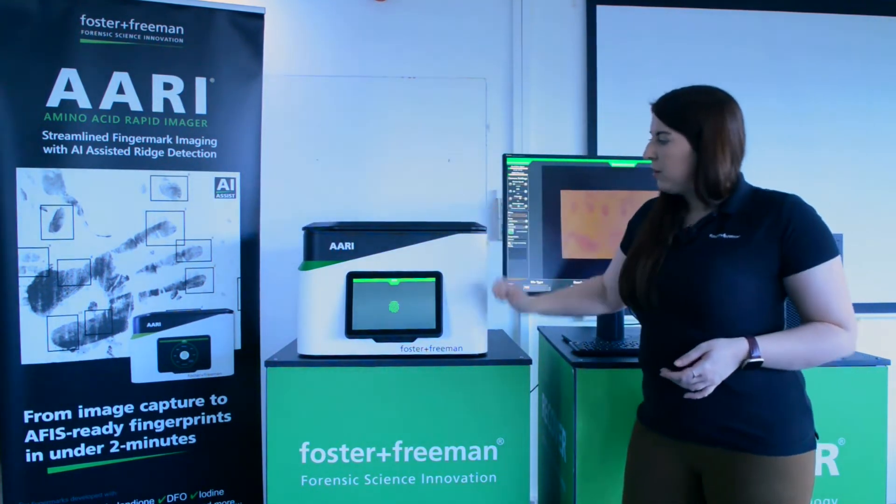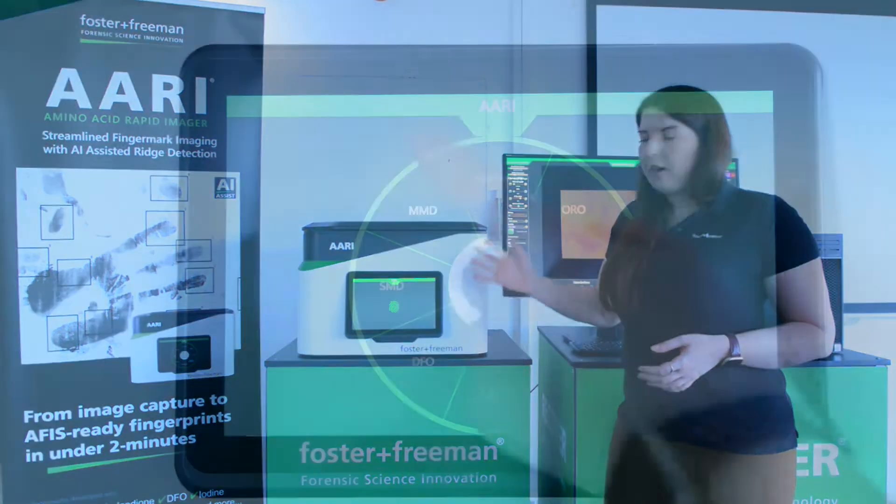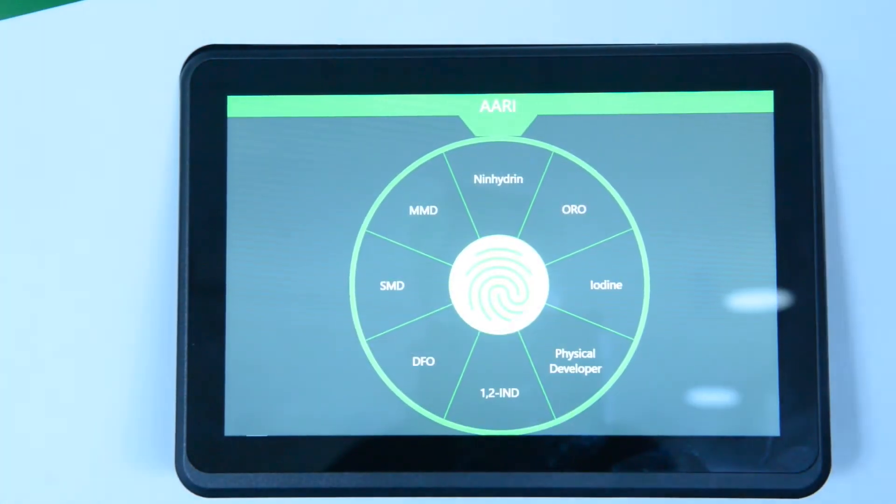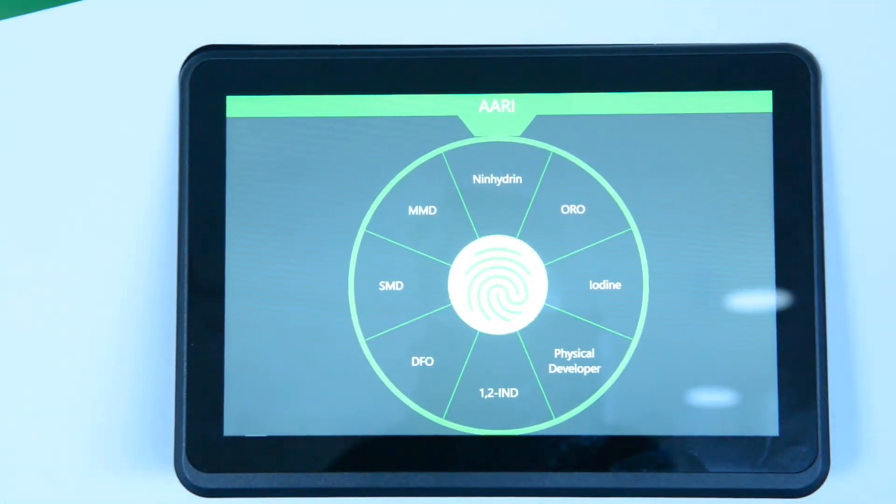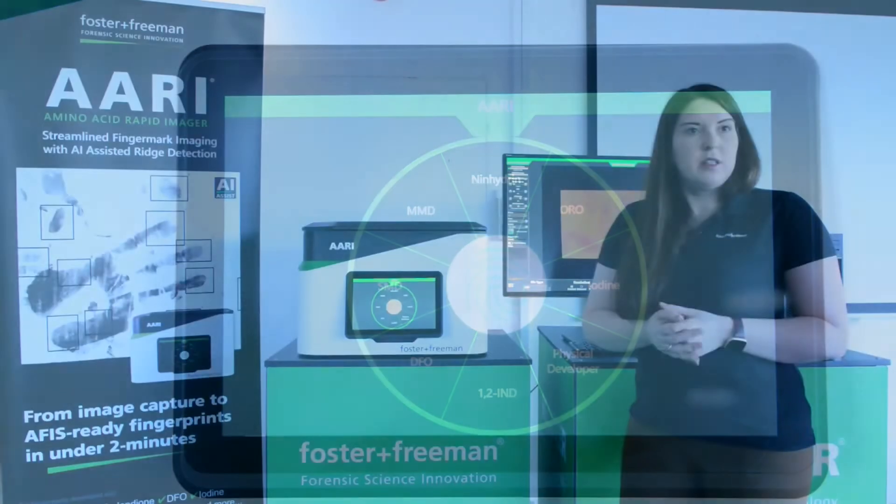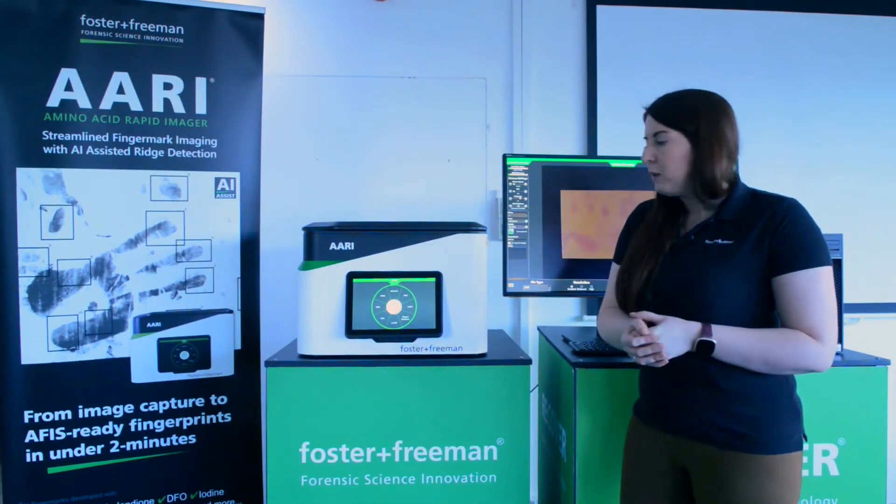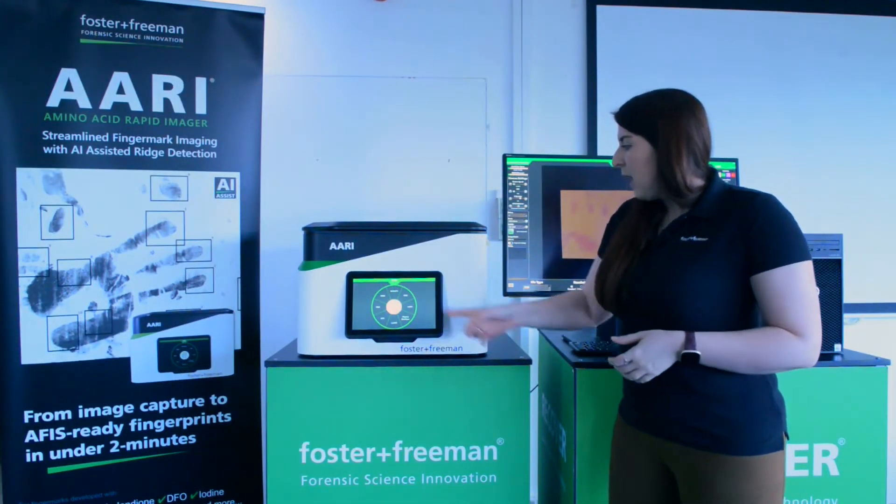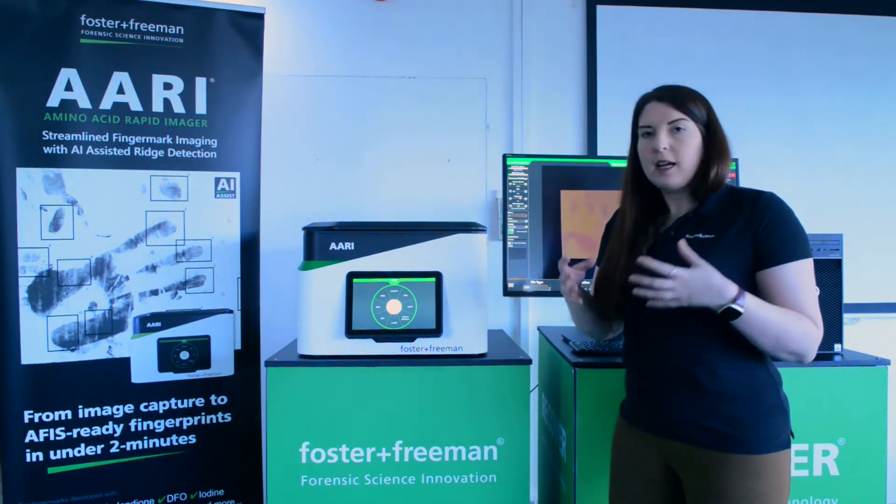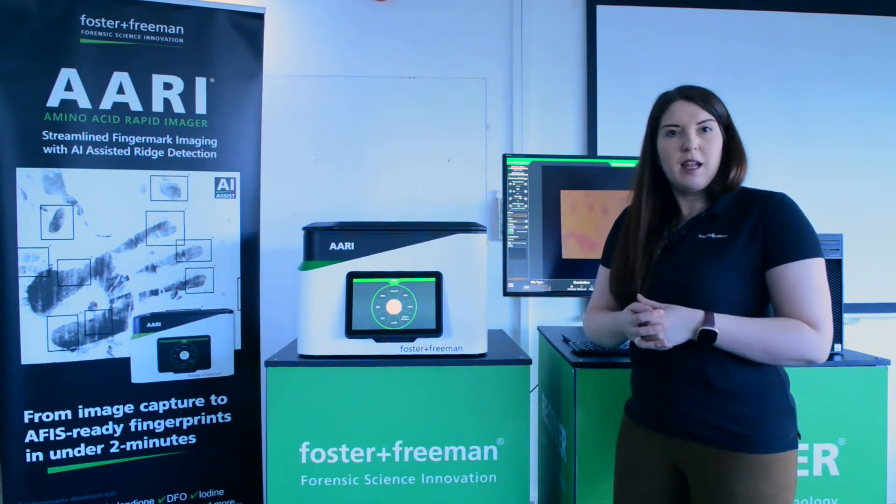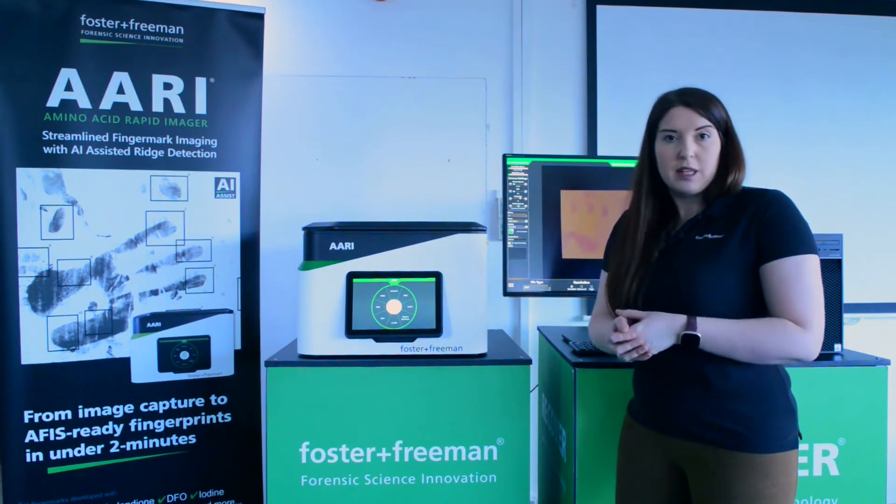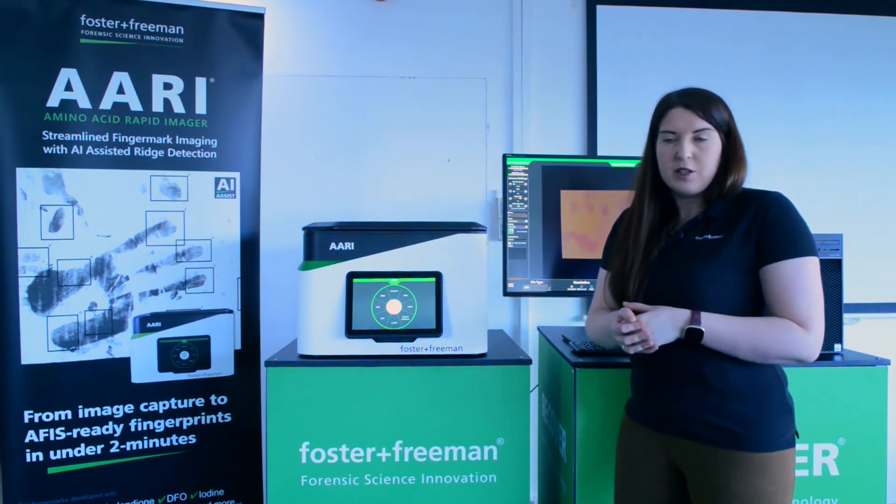Now, on the front of the AARI unit we have a touchscreen interface where when we click it, it brings up a wheel of different treatment types, different chemical treatment types of porous evidence. And you can simply click on one of these and it will set the light and filter settings on the AARI that are specific to that reagent.